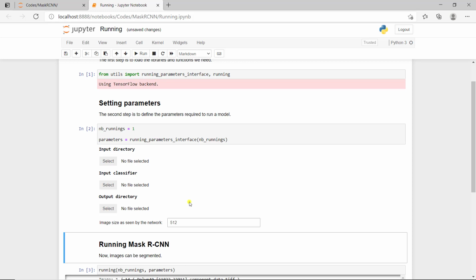However, if we use 256, it is not going to be optimal because we used data augmentation, and with the different operations applied during that augmentation, there's a cropping and also some zooming transformation.